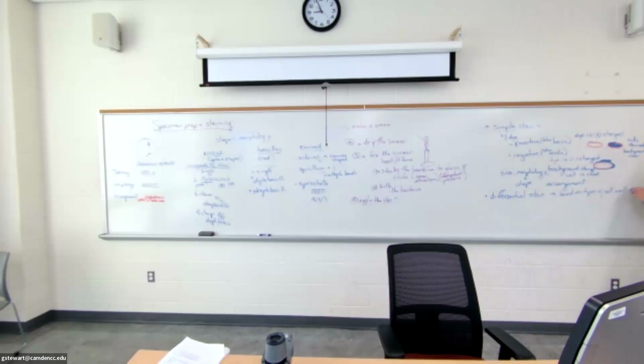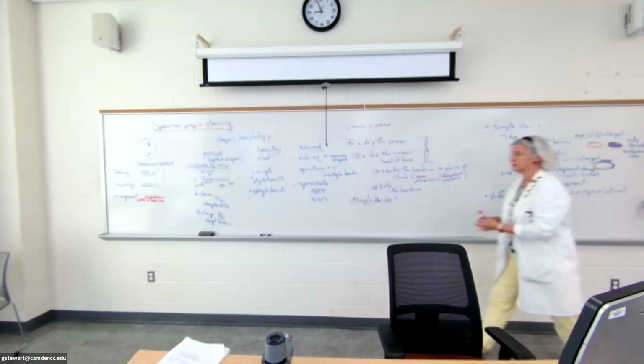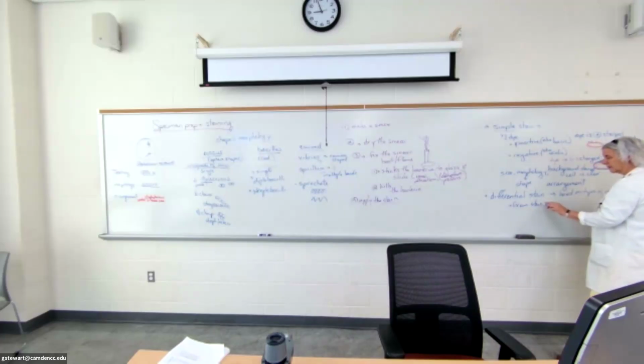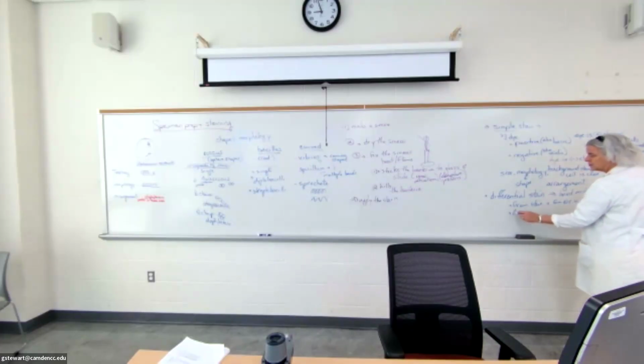Again, this will make a little more sense after we talk about chapter 4, because we're going to talk about all the different kinds of cell walls. For right now, I'm just going to give you 2. Okay. One of them is that Gram stain that we mentioned before. The other day, I think I used the word Gram stain. Capital G, Gram stain. Okay. And that tells the difference between a Gram positive cell wall and a Gram negative cell wall. And that's important for diagnostic purposes as well as identification purposes. And the other major differential stain is one we call the AF for acid fast.